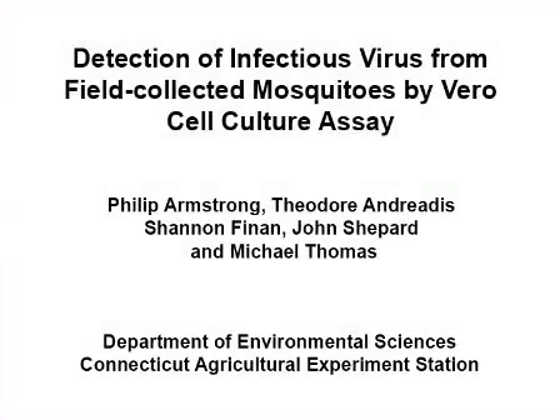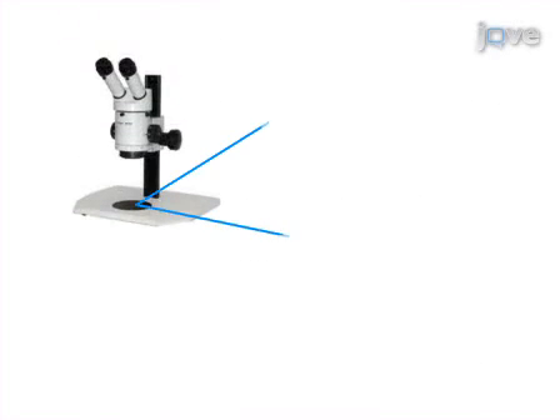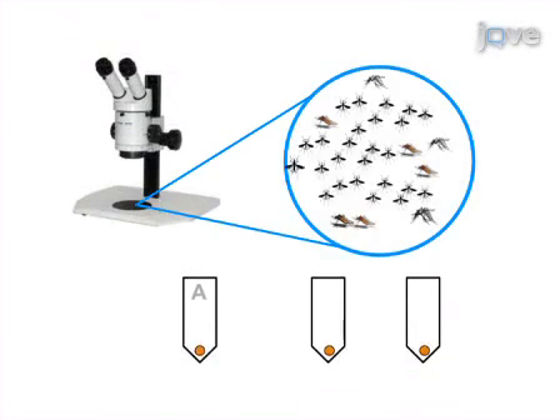The overall goal of this procedure is to screen field-collected mosquitoes for viral infection by varrocell culture assay. First, the mosquitoes collected in the field are sorted according to species.